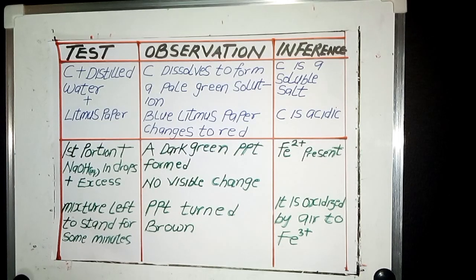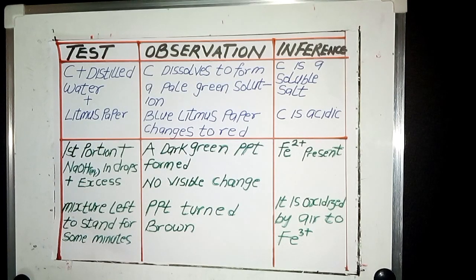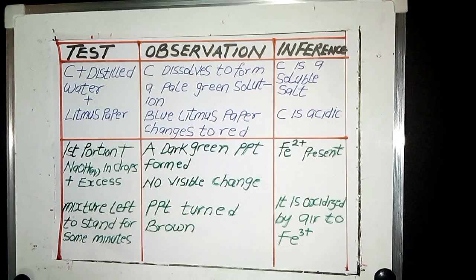So today we're going to be looking at the NECO chemistry question on the salt analysis. That's number 2 questions on the practical, which is going to be, I think, 21st of October. So this is just like a guide to the salt analysis part of your chemistry practical NECO question.